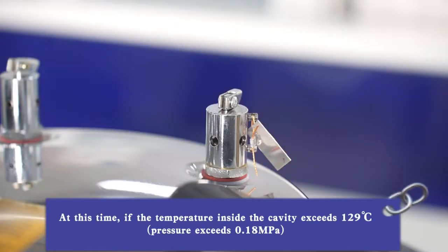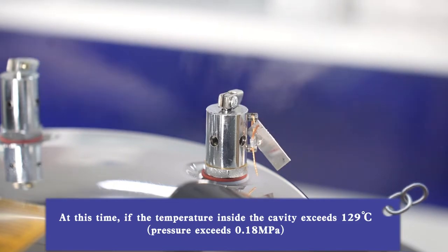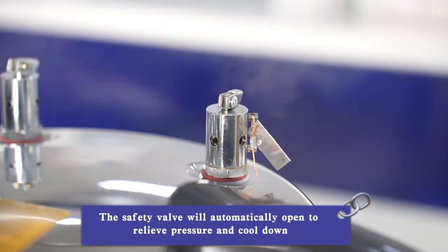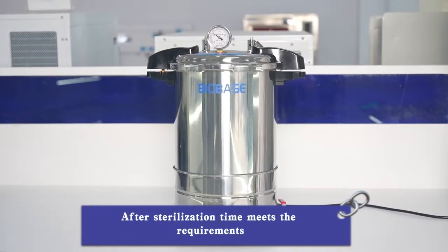At this time, if the temperature inside the cavity exceeds 129 degrees or pressure exceeds 0.18 MPa, the safety valve will automatically open to relieve pressure and cool down. After sterilization time meets the requirements, disconnect the power supply.